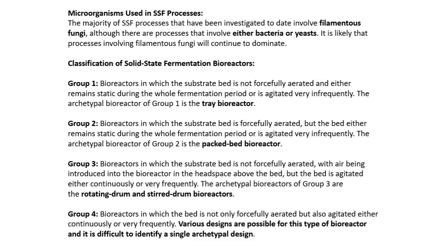The bioreactors in which the substrate bed is not forcefully aerated, so it is not aerated by using a fan or some blower. Nothing is used, and it either remains static during the whole fermentation period, or is agitated very infrequently. It is not agitated, or very rarely, perhaps before starting the inoculation process, or after the inoculation, after the growth of the complete fermentation. That's all. This is a very simple type. This type is called group 1, that is named as the tray bioreactor.